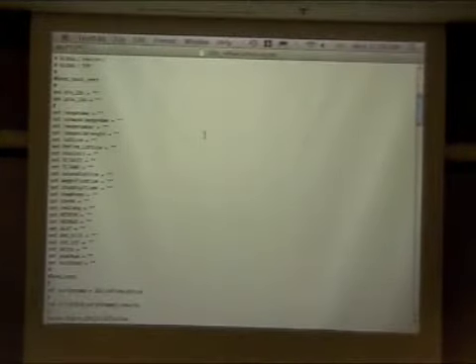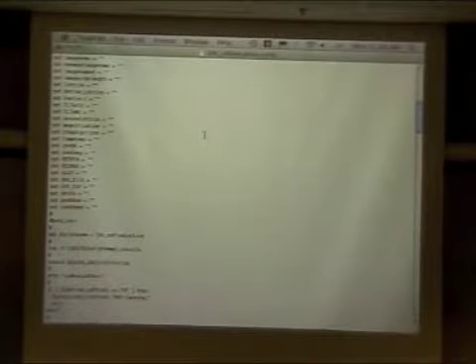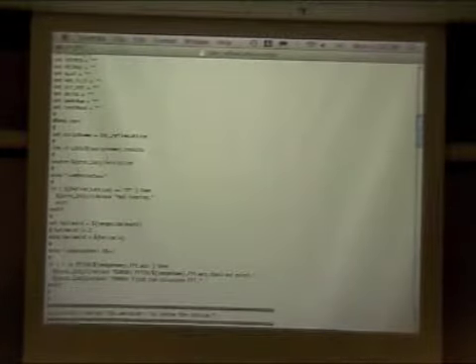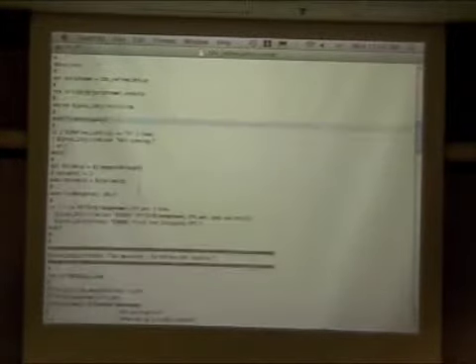So if, for instance, we were to say set tilt axis equals blank, this represents a template. It copies the template to your local image processing directory, fills in all of these empty quotes with the appropriate value from 2DX, and then they're defined when you run the script for the remainder of the execution. So again, this is really standard shell scripting stuff. It's hopefully not too complicated, or at least not much more complicated than the scripts that exist already. Beyond that, we have a few little semaphores like evaluate, which doesn't do anything anymore. I should take that out.